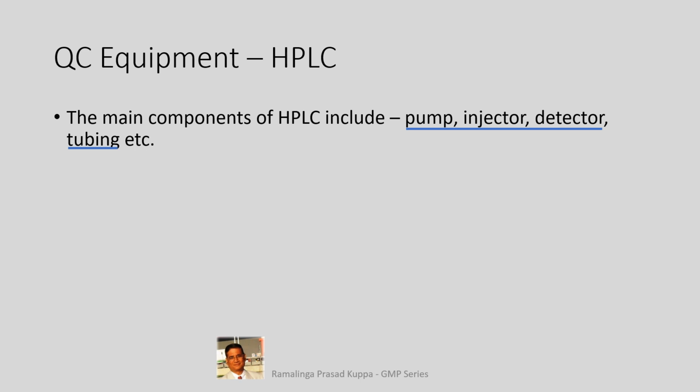Injectors are of two types basically. One, the earlier models of HPLC, almost dated 5 decades ago. The injection volume used to be measured by an external airtight syringe and injected into the system for analysis. Later, the invention of the Rheodyne type of injector made the chromatographer's life easier. It has accurate and reproducible fixed loops like 5 microliters, 10 microliters, 20 microliters, etc. You don't have to worry about varying peak areas as in the case of directly measured injections.